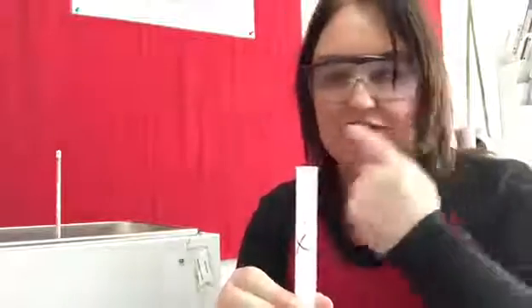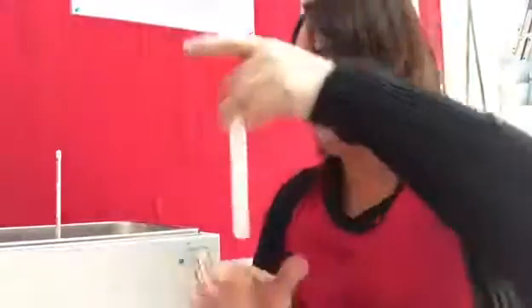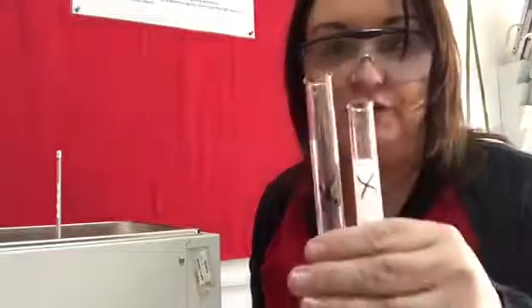As per the instructions I've mixed my two test tubes together — enzyme, buffer solution, and milk solution. As you can see it's brimming right to the top, and that's never good. A consideration before the start of the experiment is whether your full quantity of solution will fit in the test tube. I'm going to transfer it to a larger test tube, but before I do that I need to mark it with the X. I've actually used a different pen, and if you're going to share results with the rest of your class you should consider using the same pen so you've got the same thickness of line and the same depth of color for your cross.